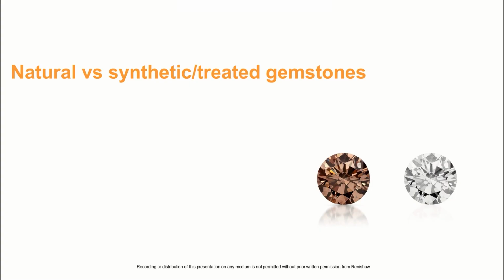Thanks so much, Tim, for this introduction on the features that make Raman and PL spectroscopies so useful for the gemmologist. And thank you all for being here today and watching this Renishaw webinar. So using some examples, I want to show here the benefits of these techniques to investigate if a natural gemstone has been treated, or how to determine if a stone is natural or a laboratory grown one.